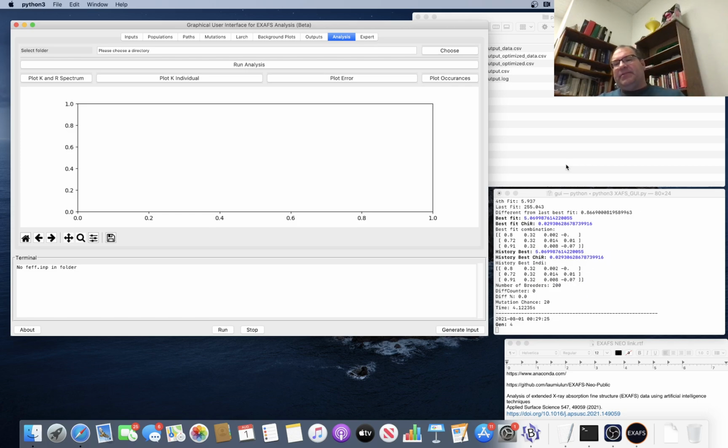And this will take us back to what we've been using in the past, paths 1, 4, and 5, so it's only taking 3 to 4 seconds per generation. But we'll pause again and come back when it is complete. Okay, we're coming up on the halfway point of the optimization of the three paths.